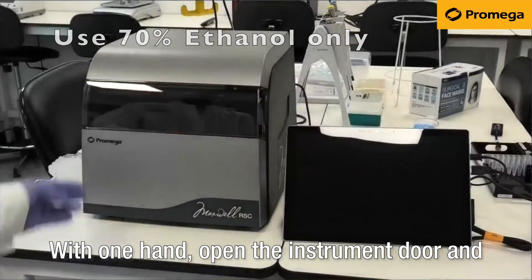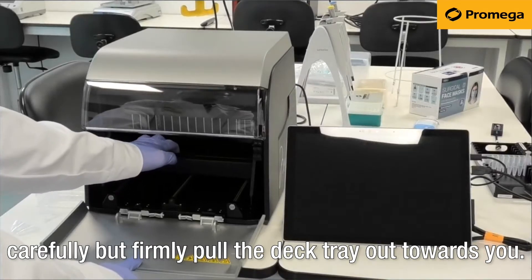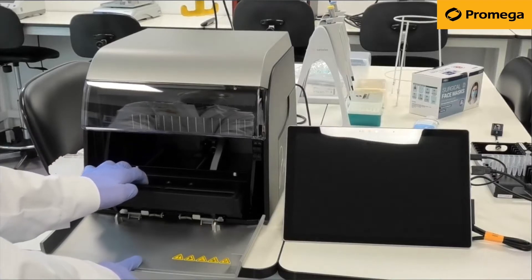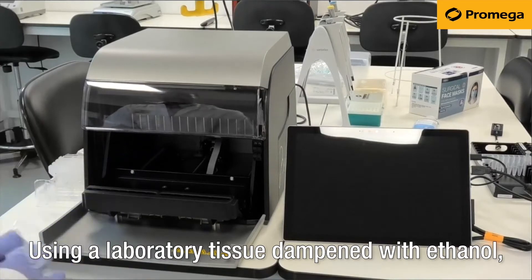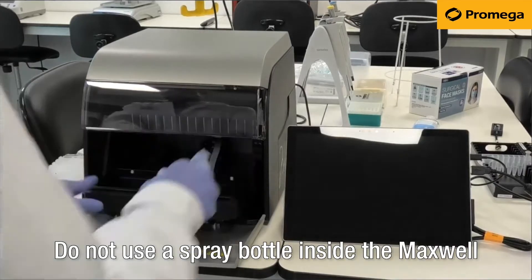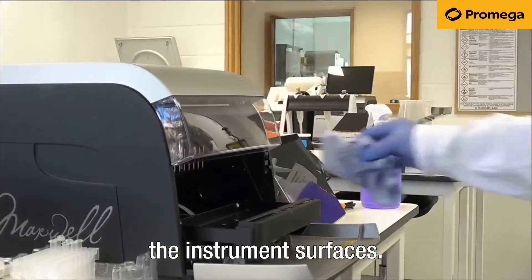With one hand, open the instrument door and carefully but firmly pull the deck tray out towards you. Using a laboratory tissue dampened with ethanol, wipe the deck tray. Do not use a spray bottle inside the Maxwell instrument, and never let excess solution sit on the instrument surfaces.